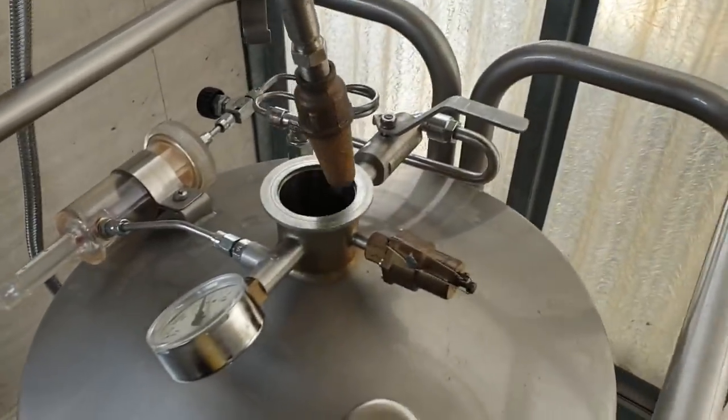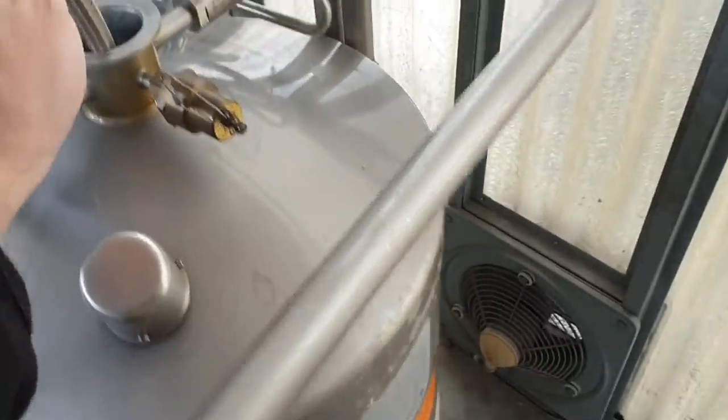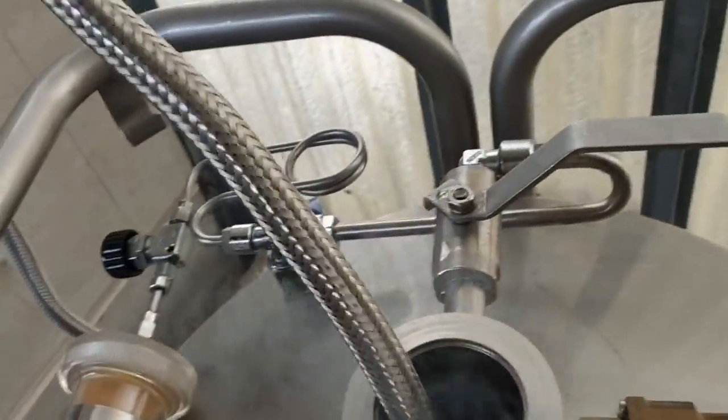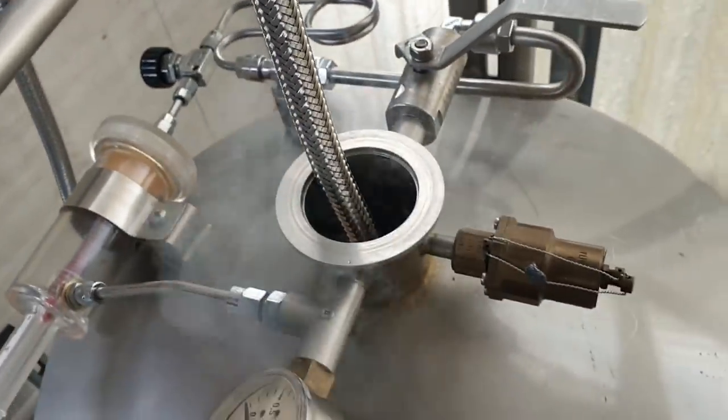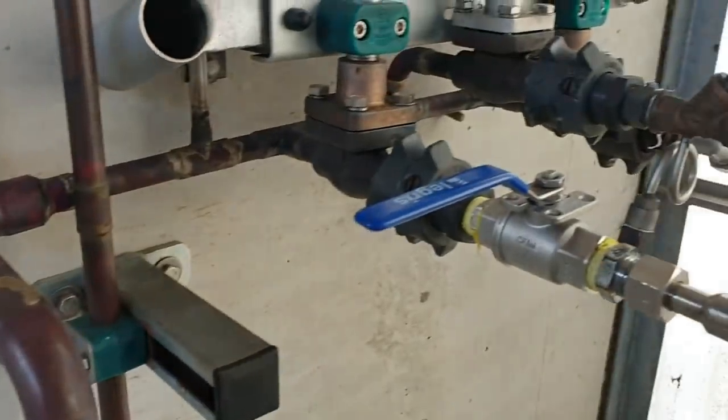This is where the fairly high-pressure nitrogen is going to go in. I'm going to go in this way a bit. In the back of it. So I'm going to put pressure on. This thing all frees up fantastically.